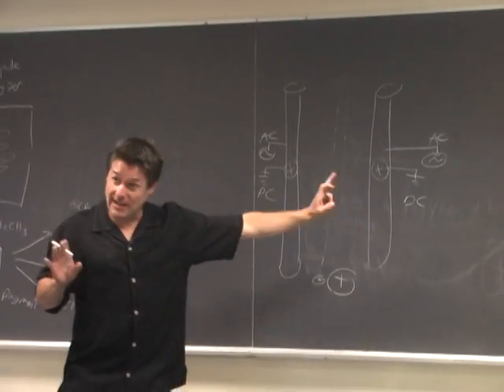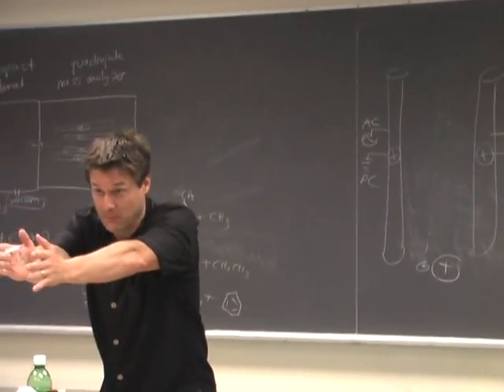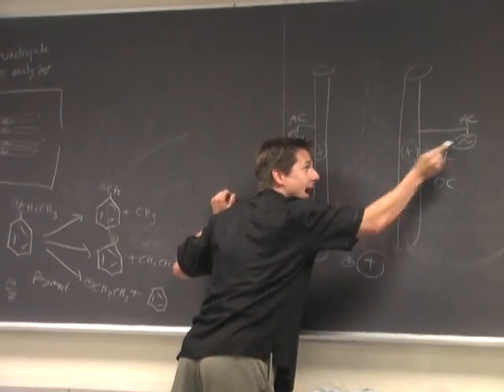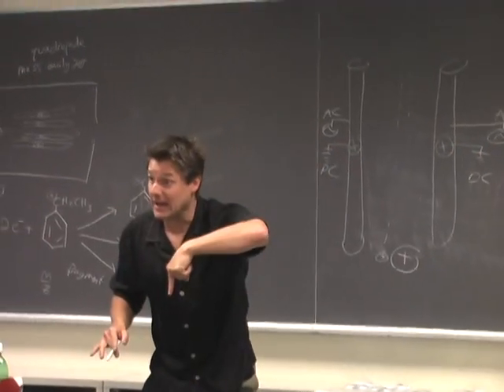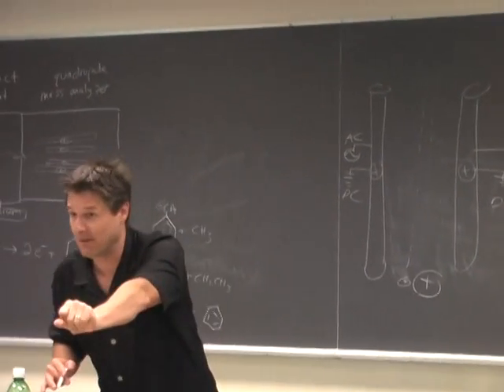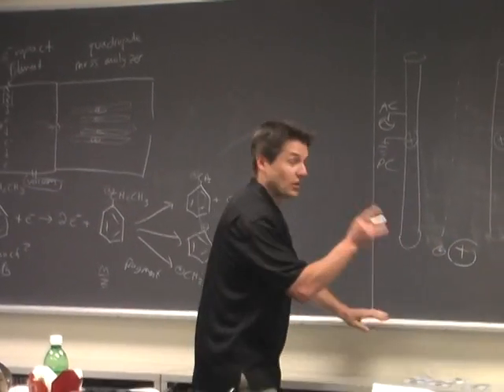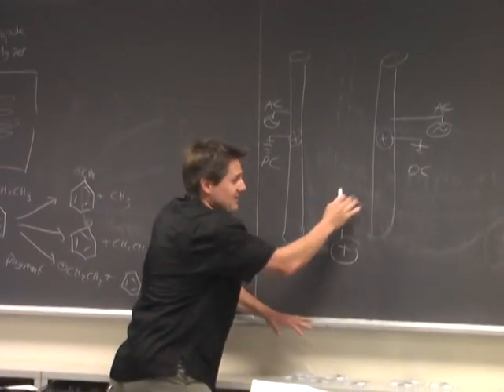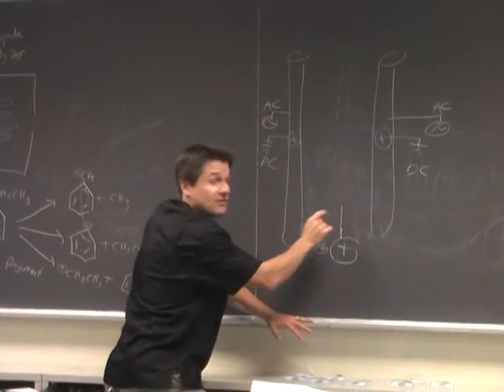Now, it's got a positive DC charge, so the overall push is for these to go straight through the middle. That's the ultimate goal with these positive DC charges. But if I start this AC current positive, then this rod's positive and it goes right through. But once this AC current turns negative and gets to a value that's bigger than the direct current, this rod turns negative momentarily. What happens when that turns negative? So let's take this big one. Big one's going through. It's repelled by these when that's positive. Then all of a sudden the AC current becomes more negative than the DC current, and it turns temporarily negative.